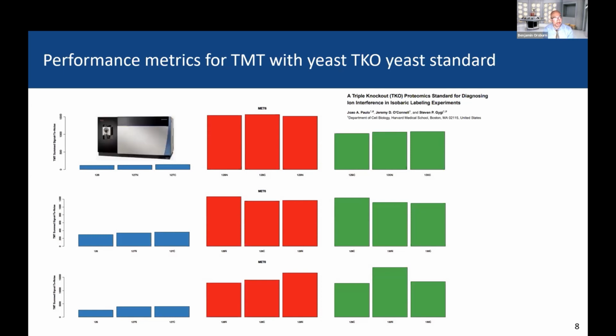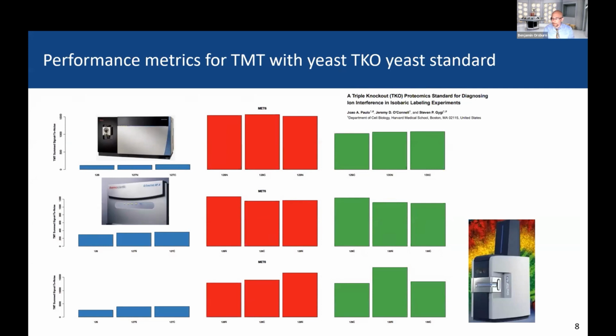And you're never going to beat the Orbitrap Fusion running MS3, right? That's not what you're aiming for. What we were trying to do is set up our instrument to be as good as an Orbitrap with a really good quad. And after a lot of work, we actually got the timsTOF there. It doesn't fit over here, and it's a theme. timsTOF doesn't fit a lot of places, right?